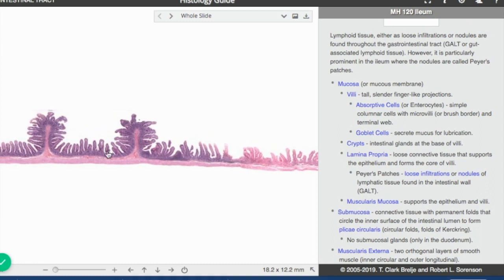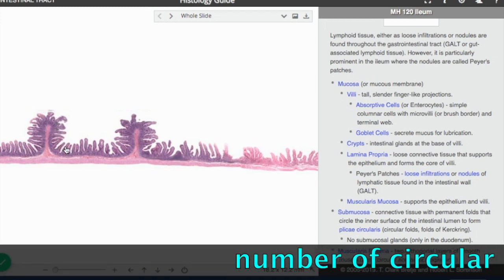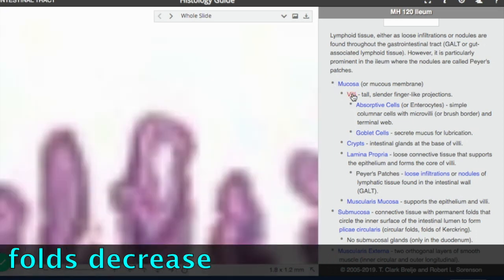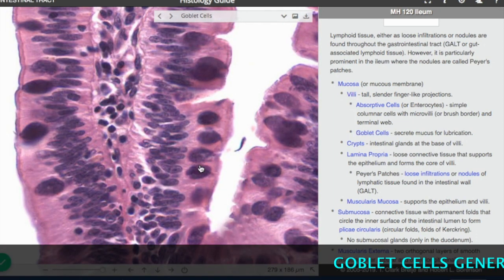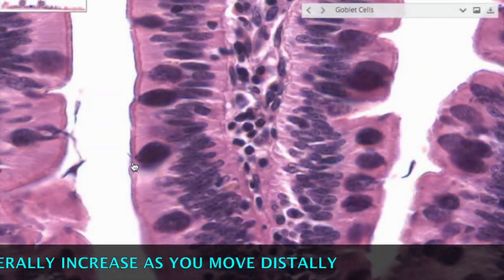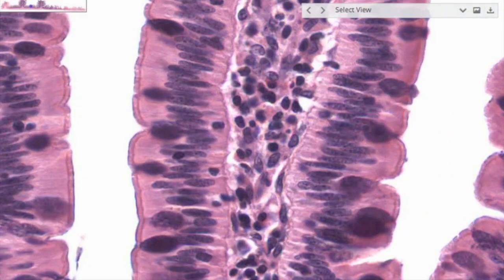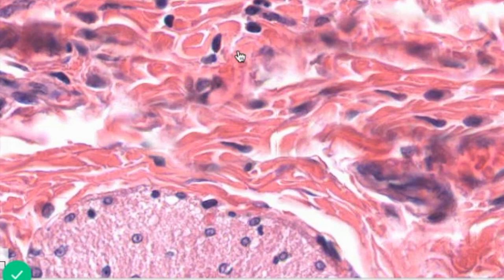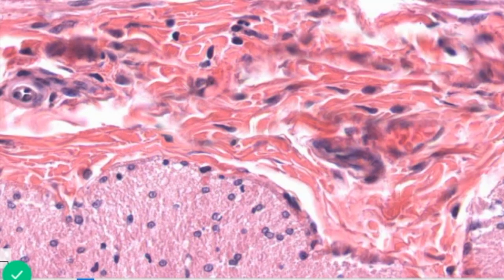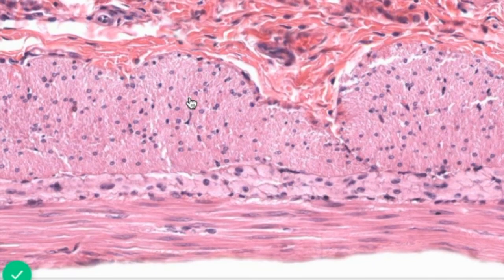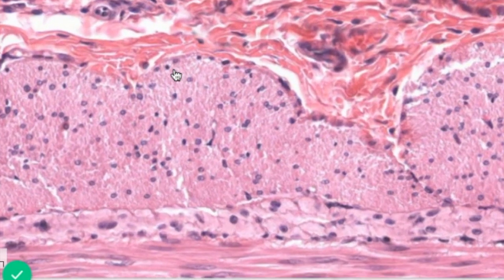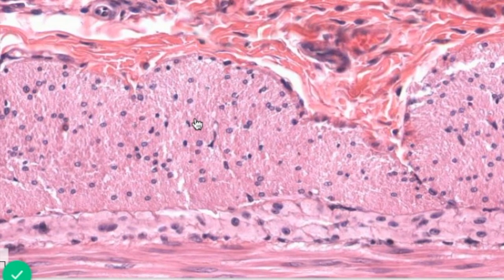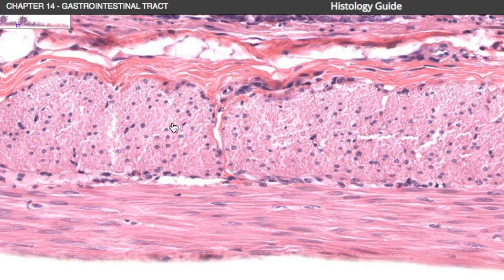Moving distally, we come to the ileum, where the final absorption is occurring. The number of circular folds decreases, but the villi are still present, along with the simple columnar epithelial lining and its goblet cells. This sample has a pretty clear brush border, which is the microvilli. We also see a very thin muscularis mucosa, and outside of that is the submucosa with fibrous connective tissue. The boundary where the submucosa ends and the smooth muscle of the muscularis externa begins is visible, and this sample clearly shows the difference between the inner circular and outer longitudinal layers.